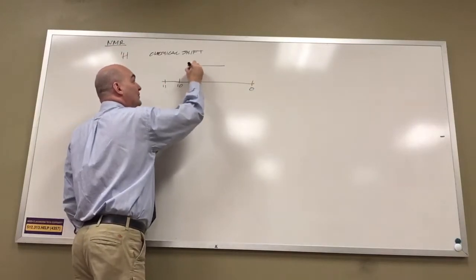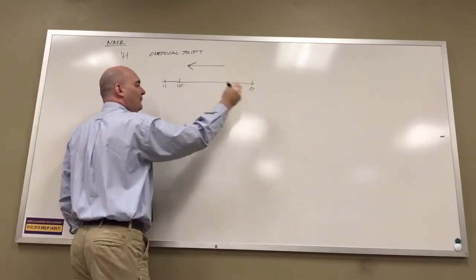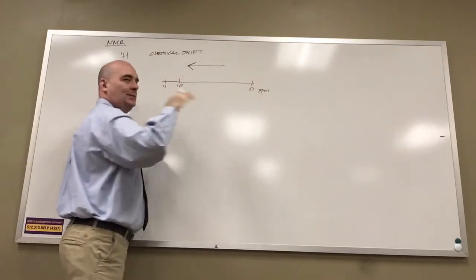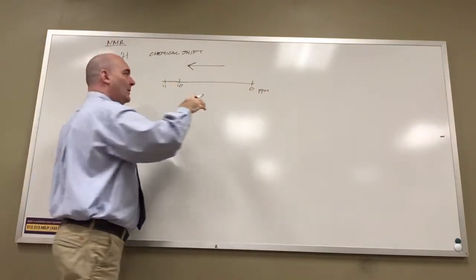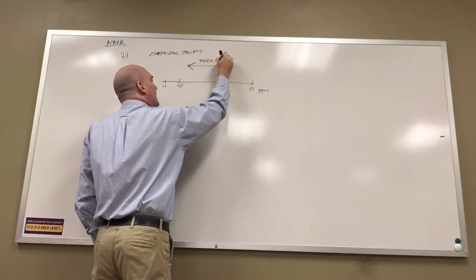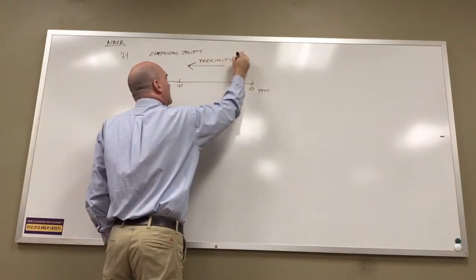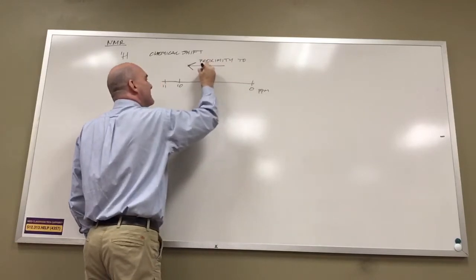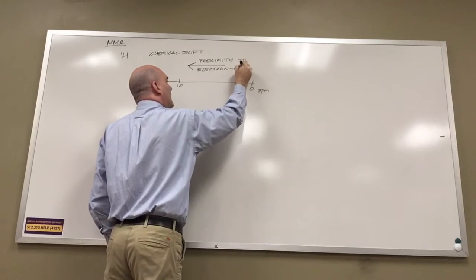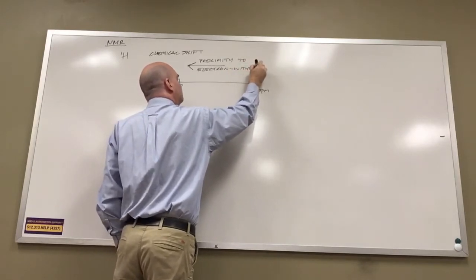What we measure on this scale, and it's really a frequency scale, we'll talk about it in regular lecture at some point later, but all we're doing today is solving problems. If you are to the left of this scale, you are near some form of electron withdrawal.